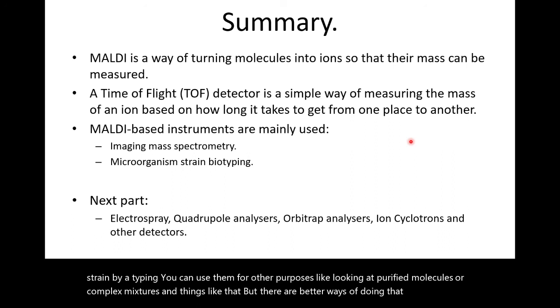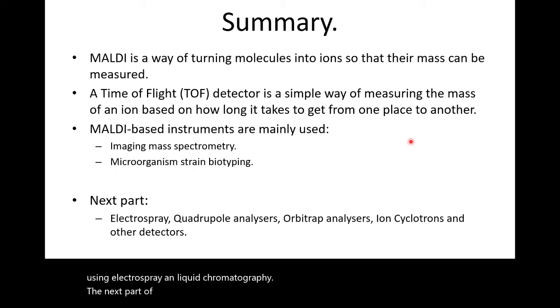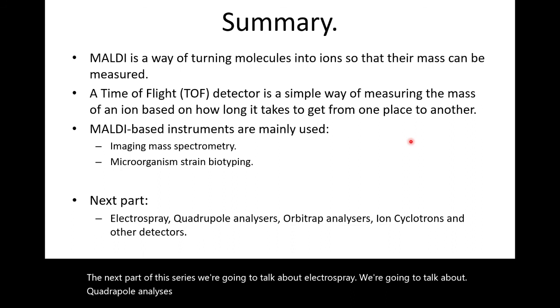The next part of this series, we're going to talk about electrospray. We're going to talk about quadrupole analyzers, Orbitraps, ion cyclotrons, and ways of detecting ions that come out of those analyzers.